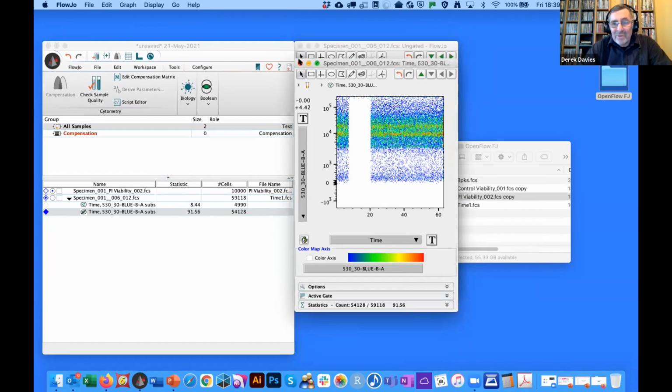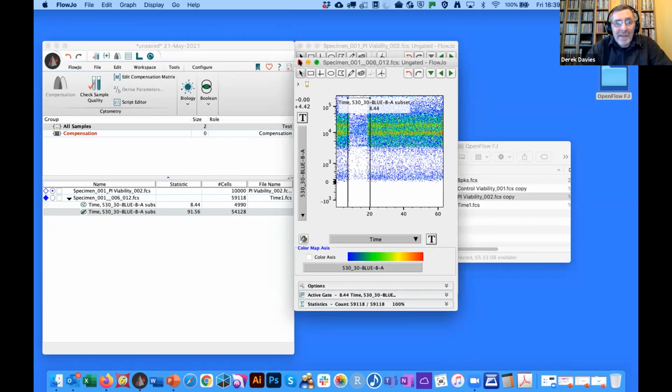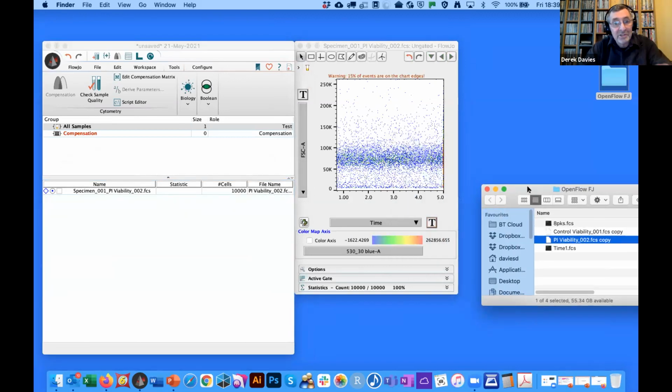You might have been better doing that when you were running, but sometimes it only occurs to you to look at that when you come to the data analysis. But that should be really your first port of call. Get rid of that to make it a little bit easier. That should be your first port of call when you start your analysis, just to make sure that everything looks reasonable before you carry on.